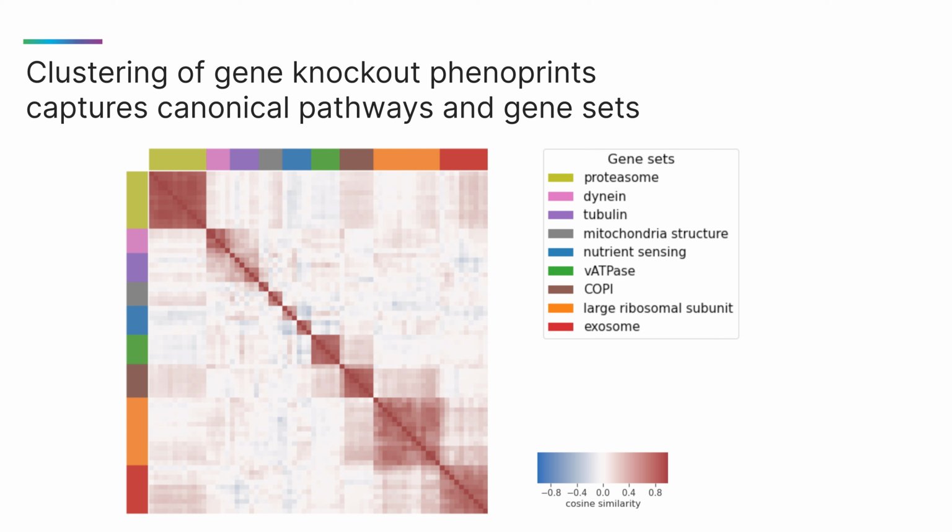And in addition to having two tight clusters for each of these gene sets, we also see a larger shared cluster across the two. And this points to collaborative functionality between these biological processes.